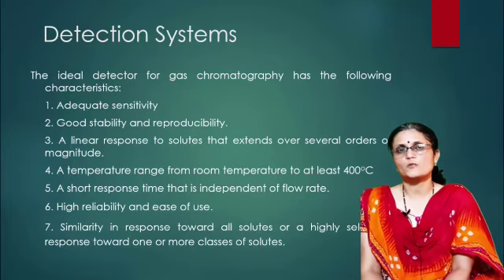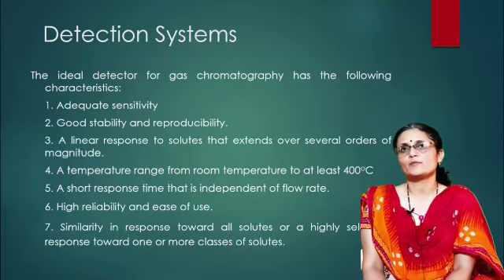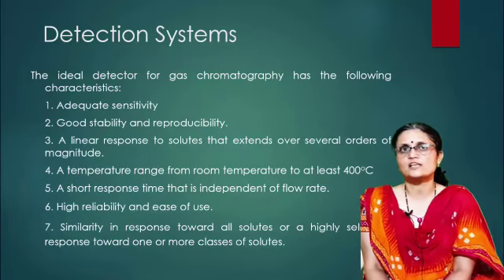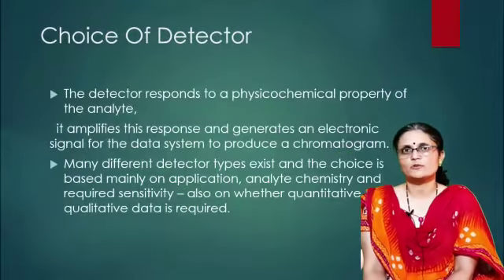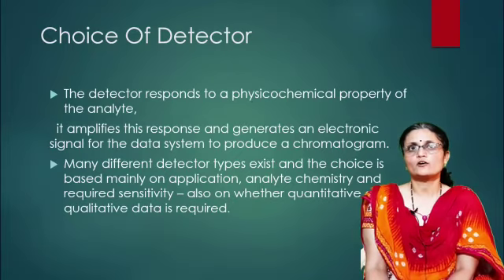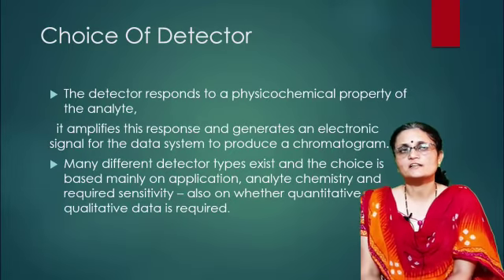Similarity in the response for all types of solutes. Otherwise, if it gives a different response to different solutes, then it will become particular for a given solute only. That is not good, and hence it should give the same response to all types of solutes. It should be highly selective for one or more classes of solutes. So various detectors are used.